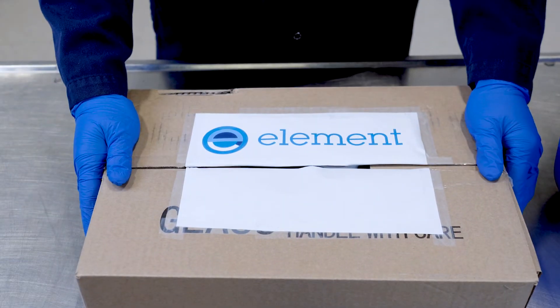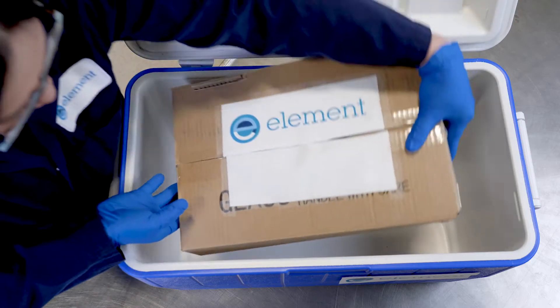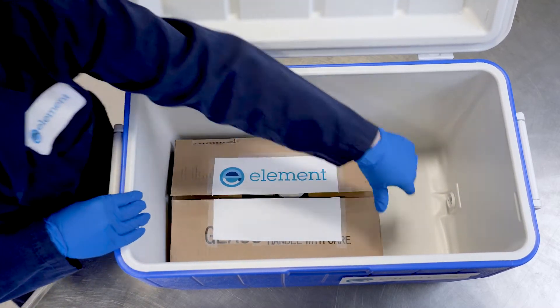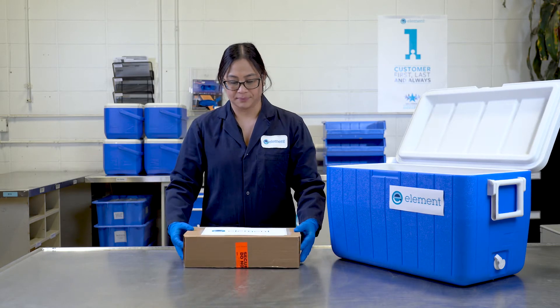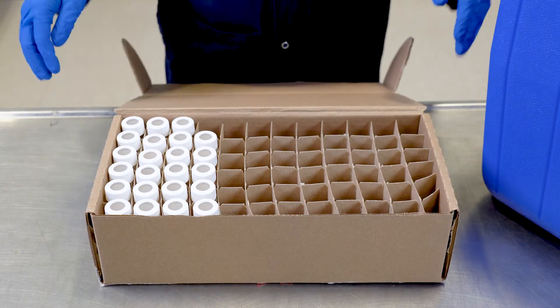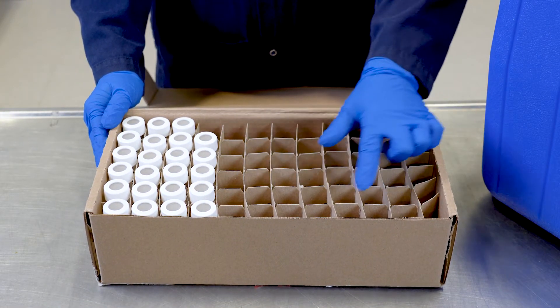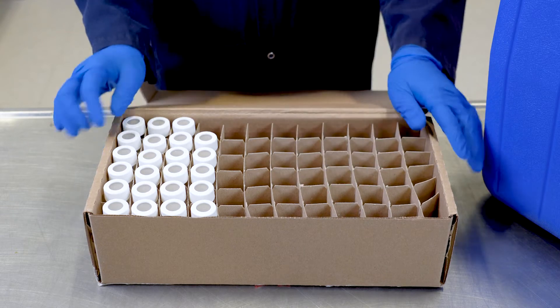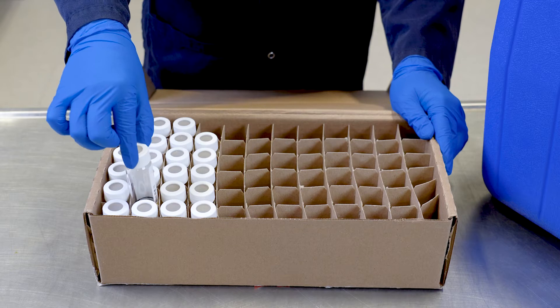The easiest way to pack a cooler is to take your box of jars and place it in the cooler. Likewise for methanol vials, shipping back to us in the box provided to you is the best way to go. The cardboard dividers prevent the vials from breaking when transported and ensure that the vials are upright during transport, which is important to prevent the vials from leaking.